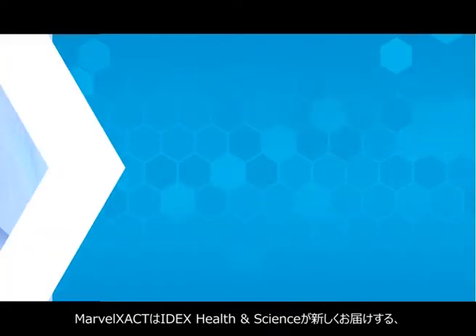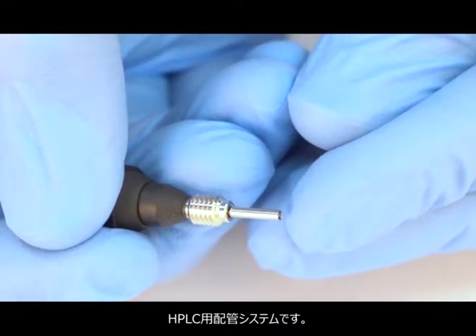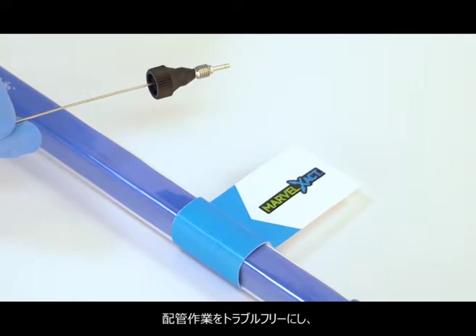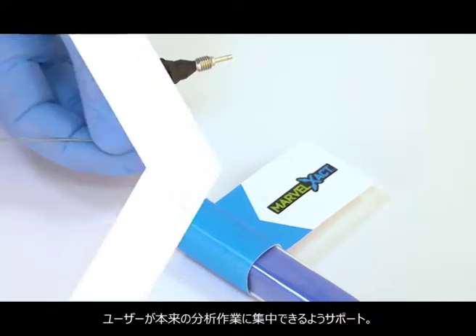Introducing Marvel Exact, a new connection system for trouble-free liquid chromatography from IDEXX Health & Science. Marvel Exact has been expertly designed to take the guesswork out of your process, enabling scientists and engineers to focus on their work.